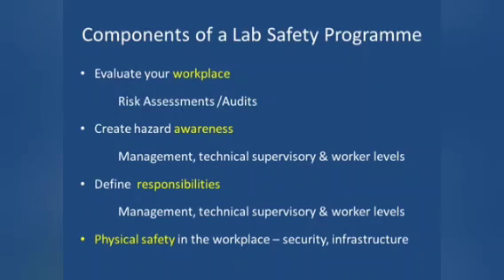Create hazard awareness in the management, the technical and supervisory level and worker levels. At the management level, there may be no awareness of storage of volatile chemicals or the disposal of hazardous waste, etc. They need to be made aware so that they can provide the space and funding to ensure safety.